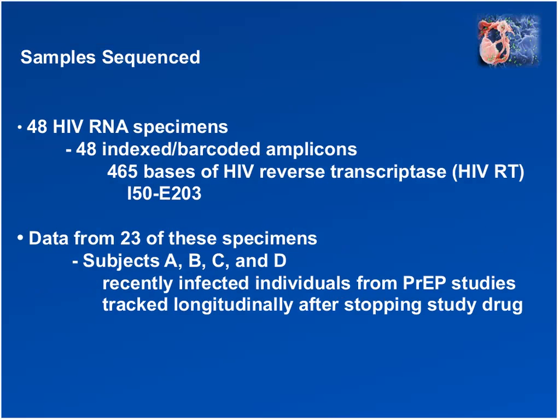So let's talk about the specifics of this comparison. A very, very basic experiment was conducted. The amplicon library that was sequenced by both systems contained amplicons defining 465 bases of the HIV reverse transcriptase gene, or I will also refer to it as simply HIV-RT, from 48 different HIV specimens. The target region spans HIV-RT amino acids 50 to 203.